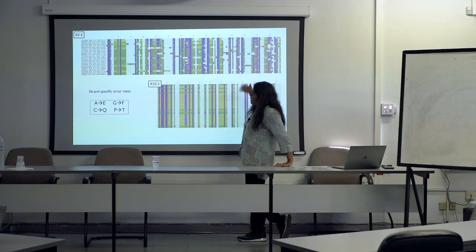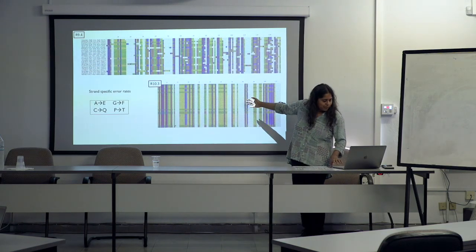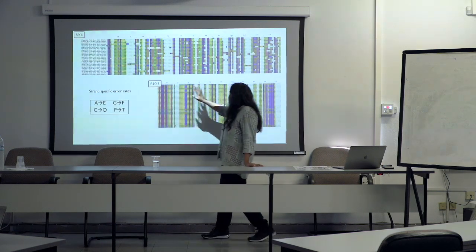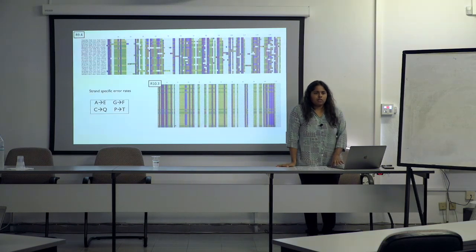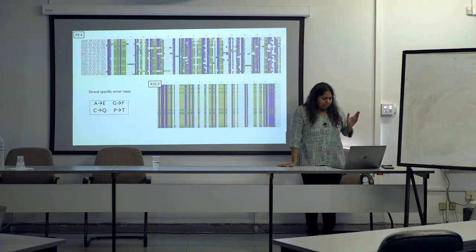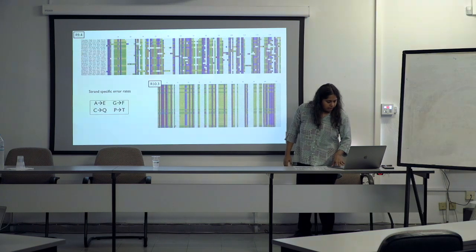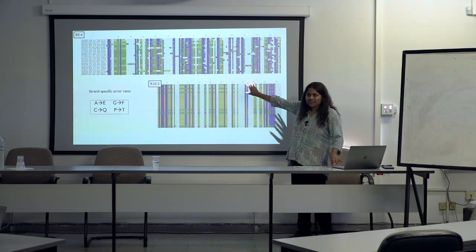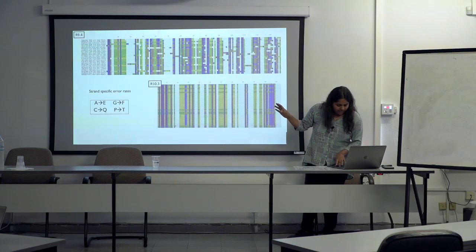But this is, I think, getting quite unnecessary. So we might want to revisit this part a bit, because our 10 point, sorry, this should be 10.4. This is a mistake, but it's pretty much identical reads here. So with 10.4, I don't think the messiness is really going away here. This is a common question, because a lot of the time people ask what these new nucleotides that are coming up are. But it's just a recoding.